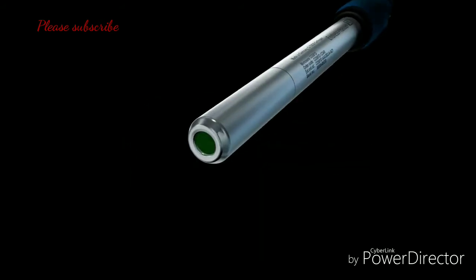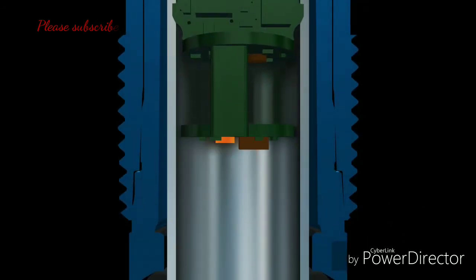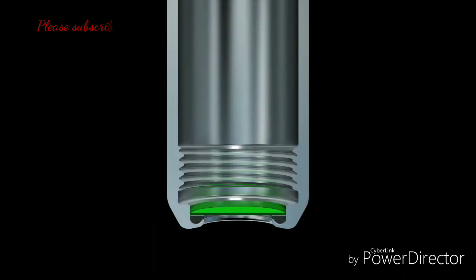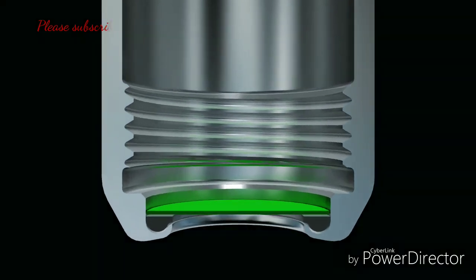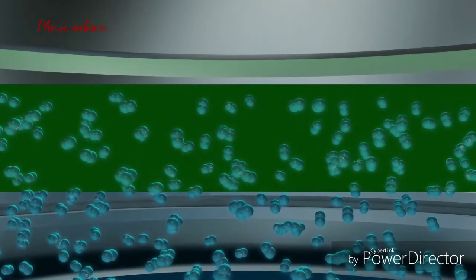The optical oxygen sensor uses the fluorescence quenching measuring principle. This sensor is equipped with an LED, a photodiode, and a separating section that is covered by an oxygen permeable layer. In this layer, there are as many oxygen molecules as in the medium. This means the partial oxygen pressure in the layer is equal to the pressure in the medium.